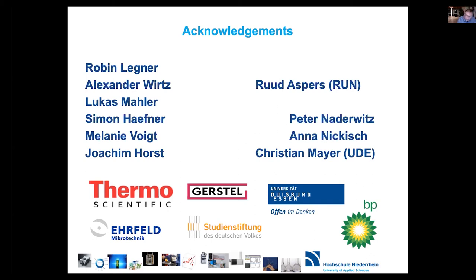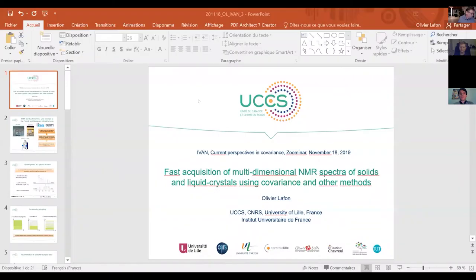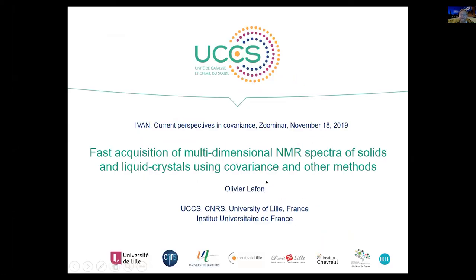Answer questions. Thank you. So our final panelist is Olivier Lafon, who will do two things. One is we've been talking a lot about covariance NMR and covariance spectroscopy in general in the solution state. Olivier will introduce us to some of what happens if you were talking about solids or liquid crystals, which have their own concerns. And also, Olivier's presentation will also put covariance in the context of other methods for rapid NMR acquisition. So on that note, Olivier, take it away.